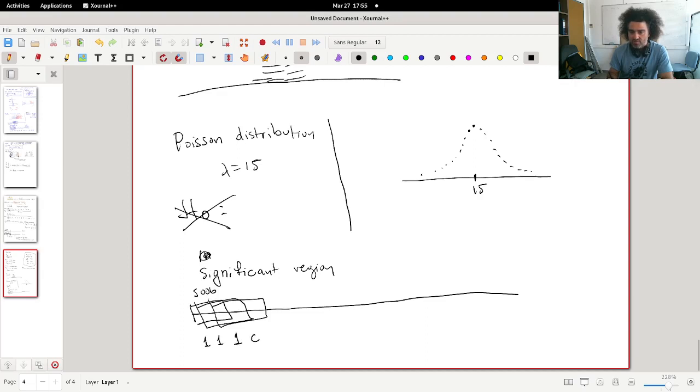So we'll have something like that: significant, significant, significant, non-significant, and so on and so forth. And if there are many regions that are significant next to each other, we will group them together as one big region that corresponds to a transcription factor binding site.